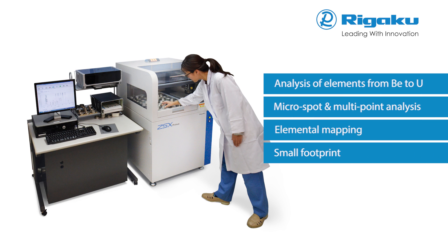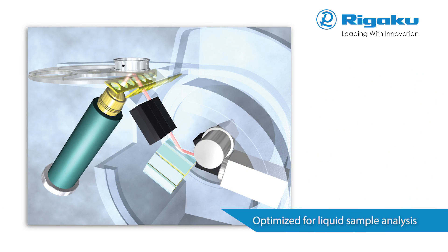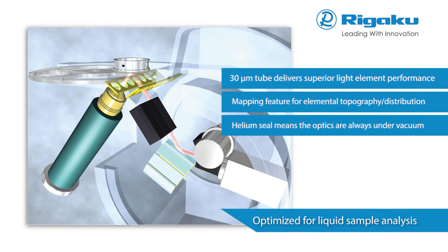Flexibility and ease of use meet any challenges in today's laboratory. This traditional tube below the sample configuration is recommended for liquid samples and fused beads, as well as metal and alloy coupons.